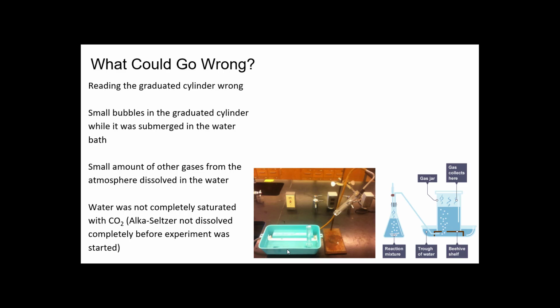And the water is not completely saturated with CO2. So what you do is you have, I think, half a tablet or a tablet, and you have to saturate it. It takes time to saturate, and students want to get in, want to get out. Even though I don't let them go early, they try their best. And I've seen it happen, they will do this reaction without the CO2 being saturated from the Alka-Seltzer, which means that they lose volume from the reaction because it goes into the water and we can't determine that. So the Alka-Seltzer has to be completely dissolved.